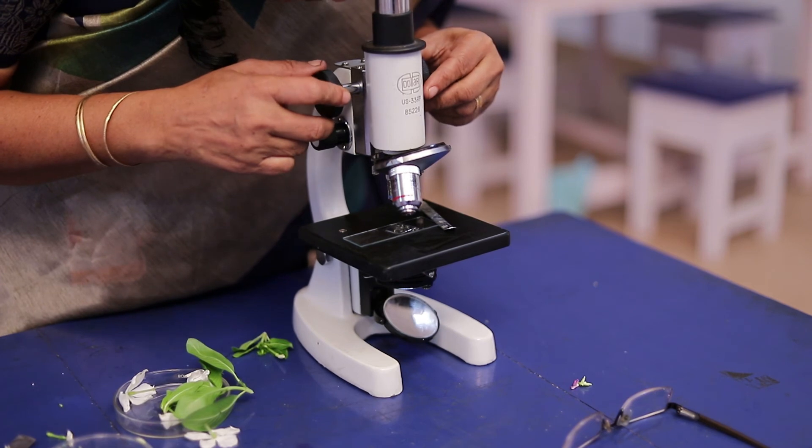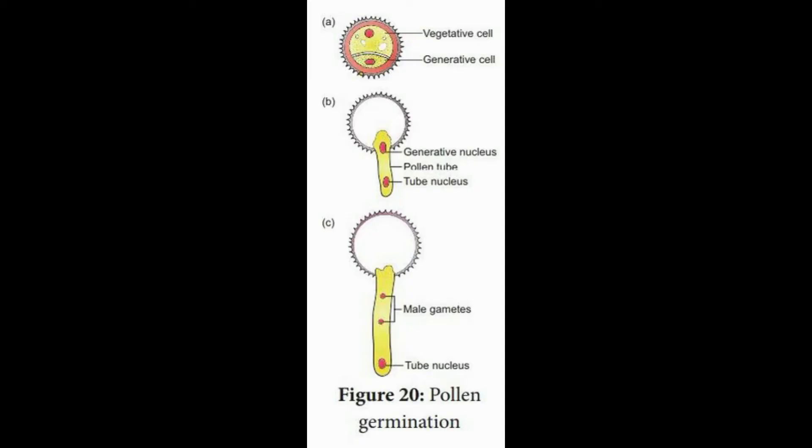We can clearly see the pollen grains — they are globular in appearance. Some of the pollen grains start germination, and germinating pollen grains are the viable pollen grains. When we observe the outer wall, it is made up of exine. The exine is a thick covering made up of sporopollenin, and the sporopollenin does not completely cover the exine. Here and there we could see some openings — these are regions where exine is absent, and those regions are called germ pores.